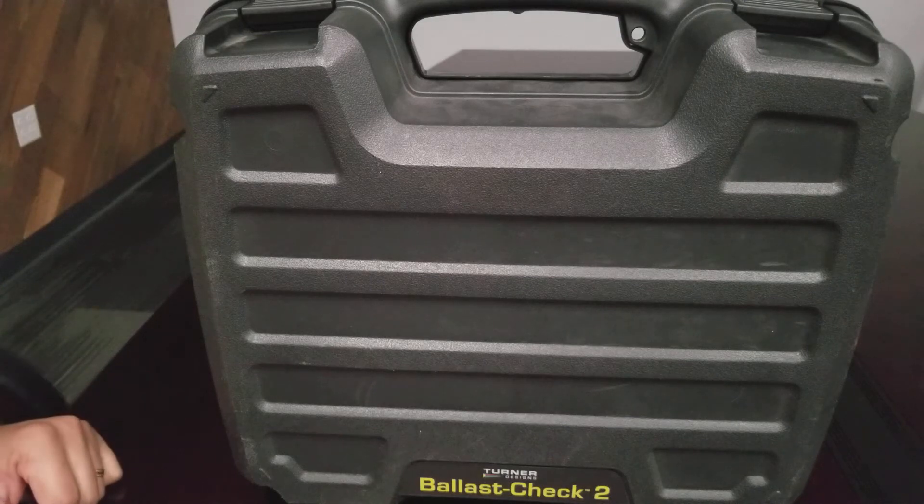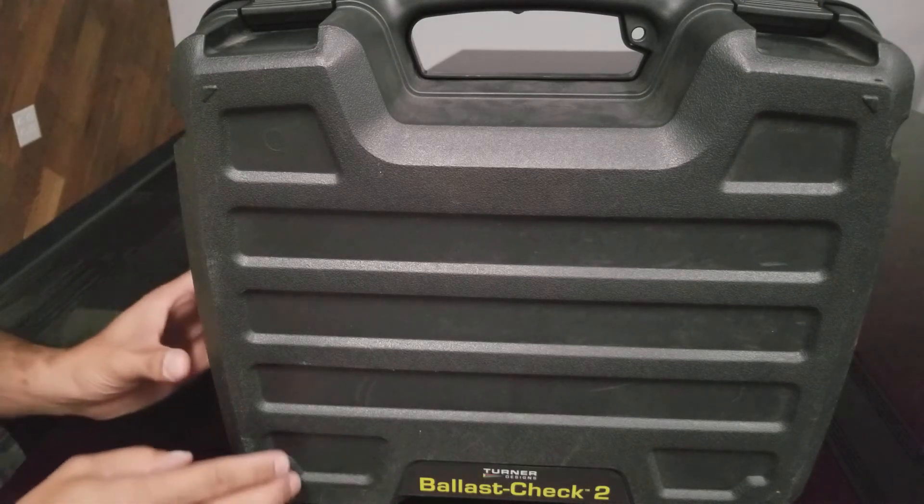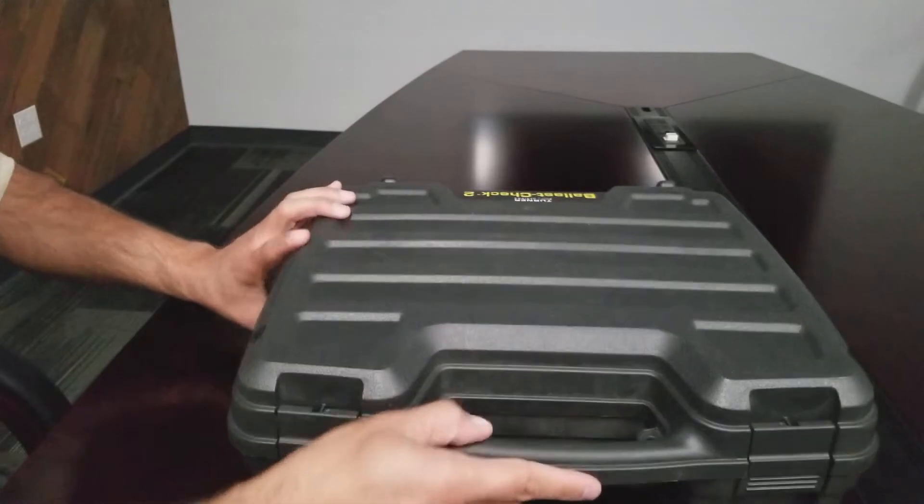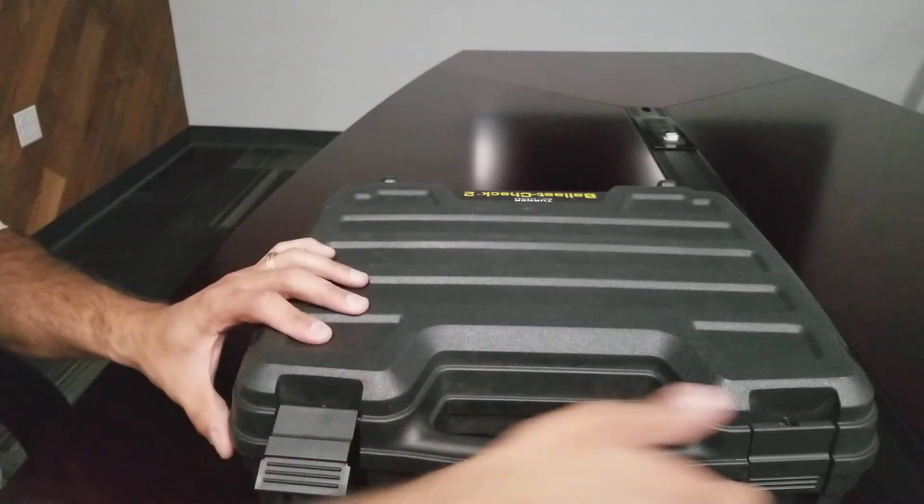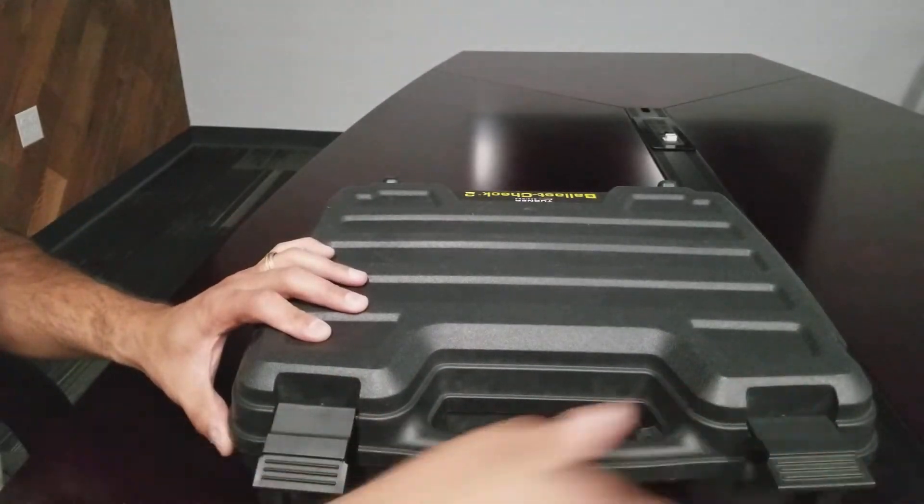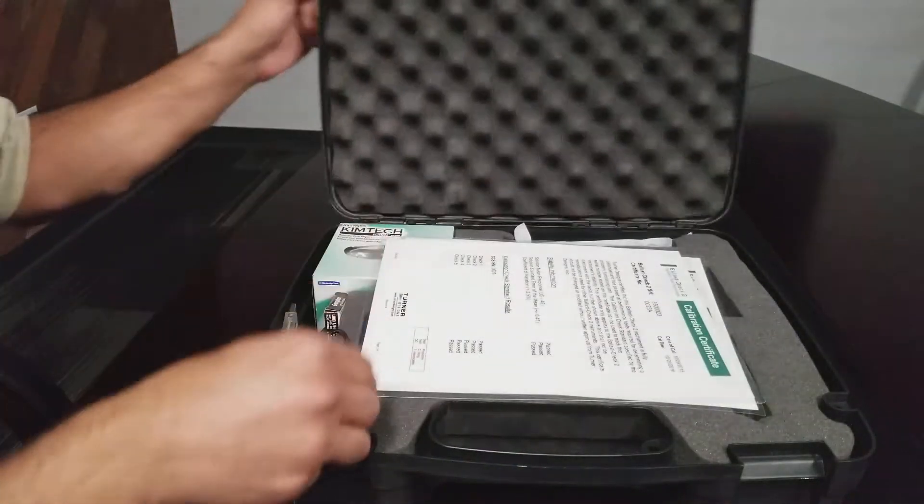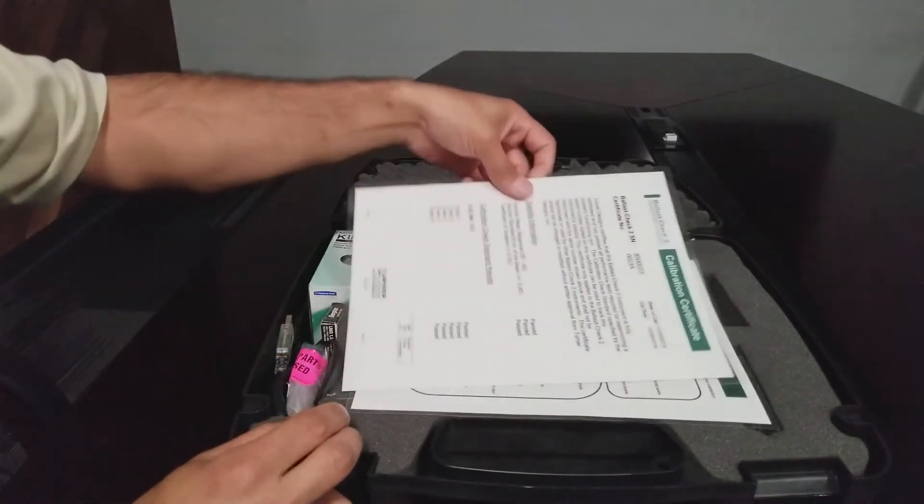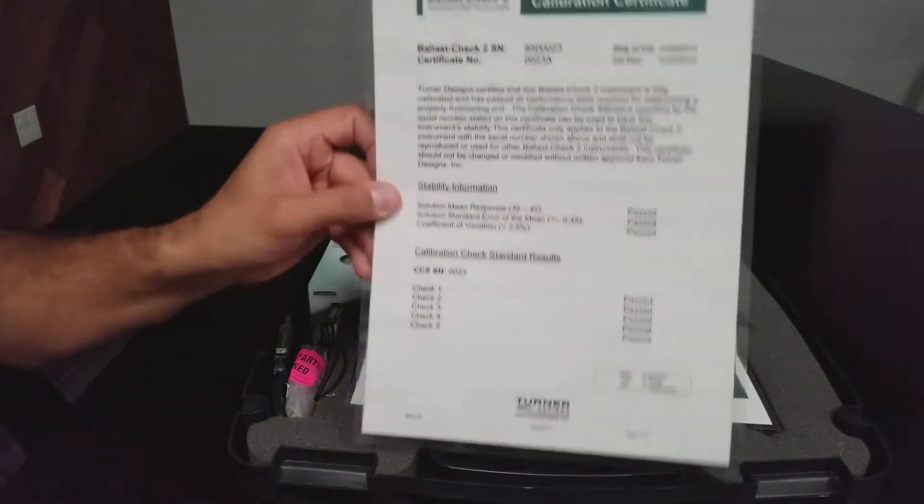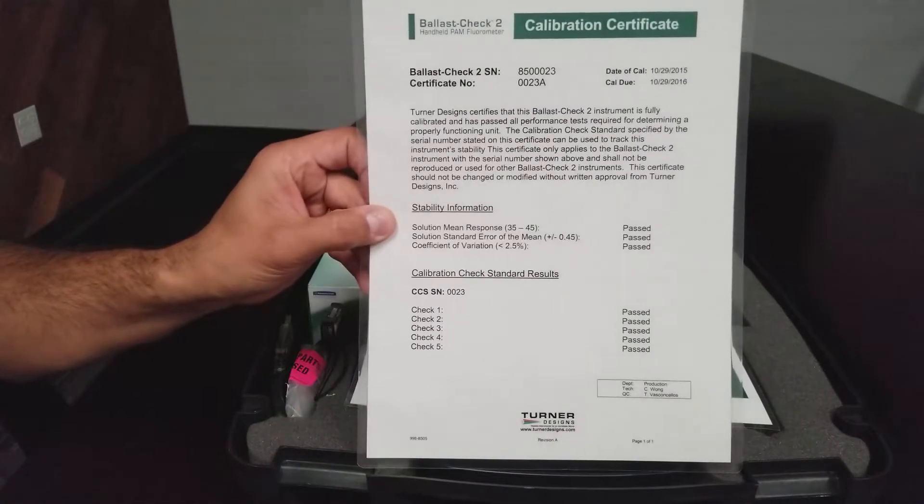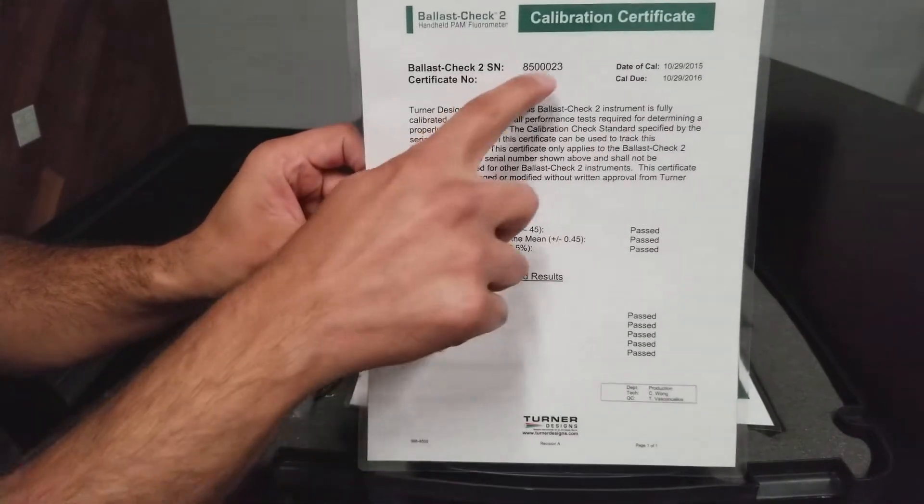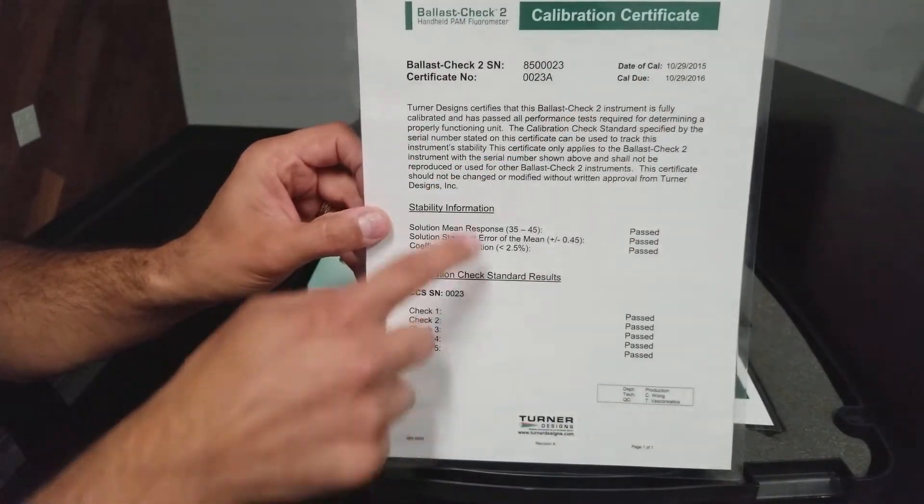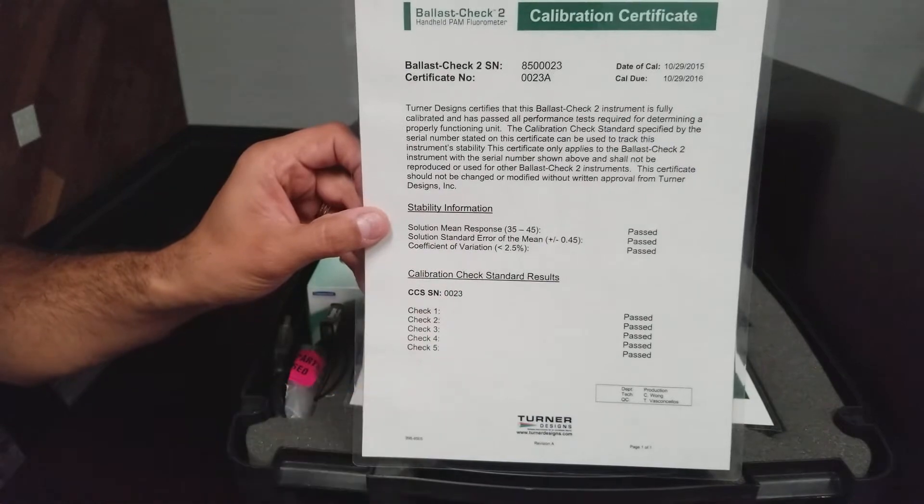The Ballast Check 2 and its accessories will be received in a Ballast Check 2 carrying case, which includes a calibration certificate with the Ballast Check 2 serial number, date it was calibrated, and the tests performed at Turner Designs.